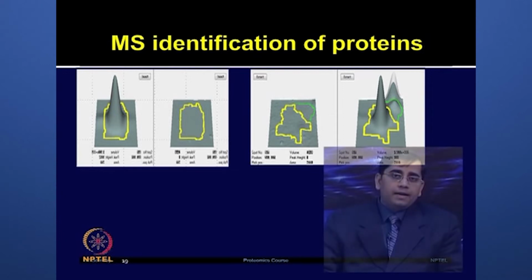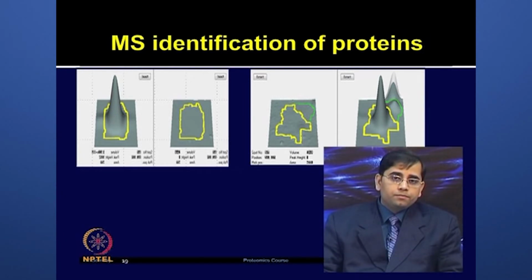Now, after the identity of these proteins was established, there were 7 proteins which were not detectable in the healthy controls and only observed in the SARS patients. The identity of those included glutathione peroxidase, PRX2, retinol binding protein, vitamin D binding protein and serum amyloid A proteins.